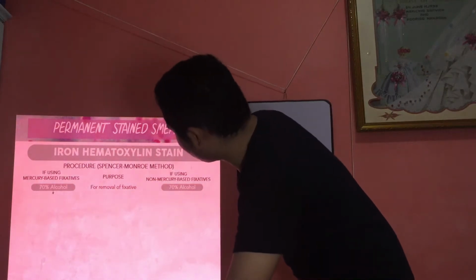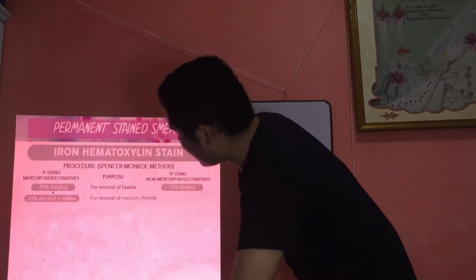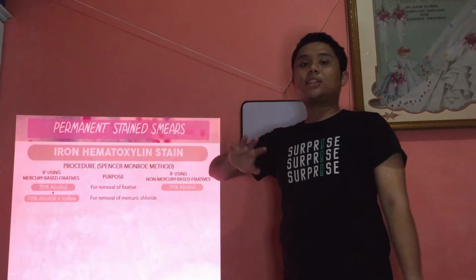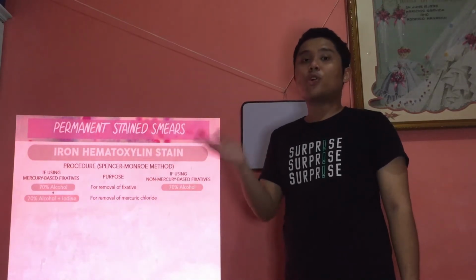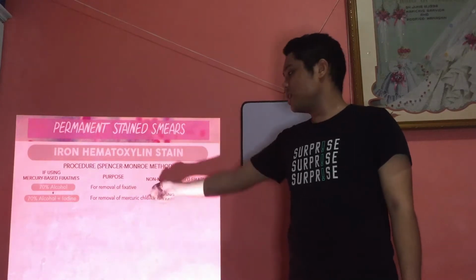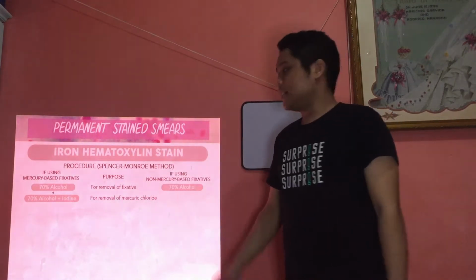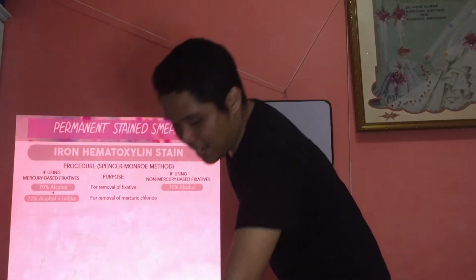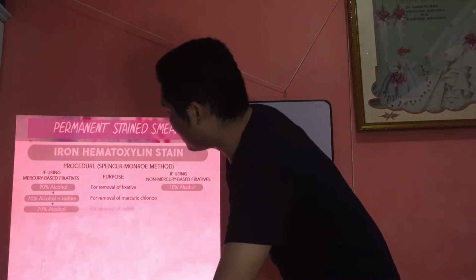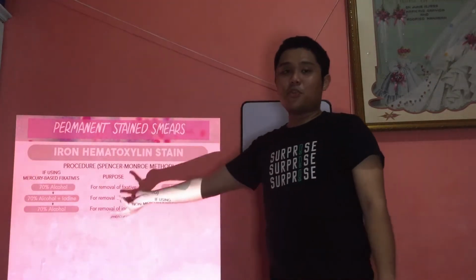Next is the procedure for mercury-based fixatives. As you can see, it also follows Wheatley's trichrome. You immerse the slide in a solution of alcohol and iodine. What's the purpose? For removal of mercuric chloride. Again, that's for fixatives that have mercury, for example PVA, Schaudinn's. Next is your 70% alcohol, because we then remove the iodine.